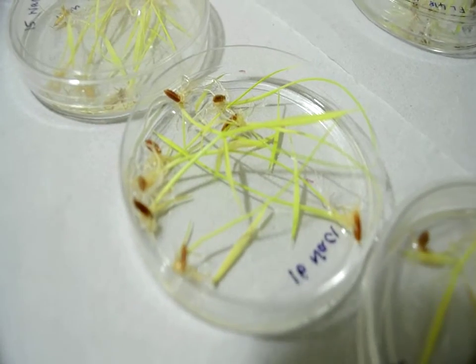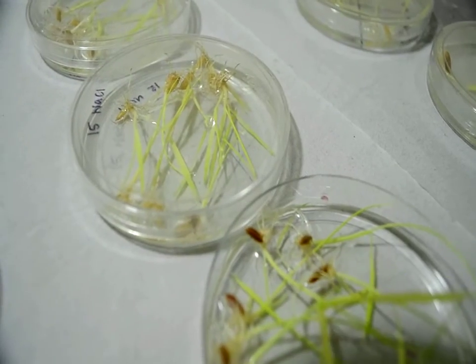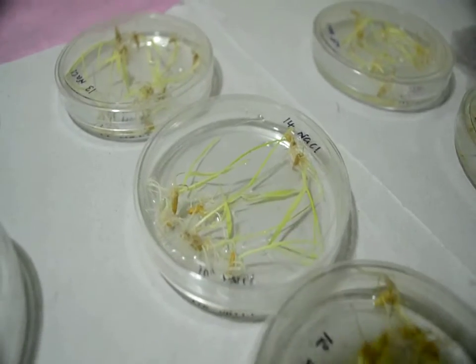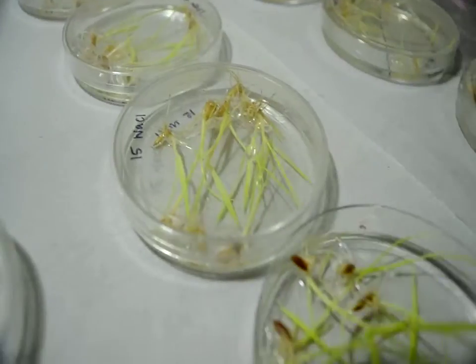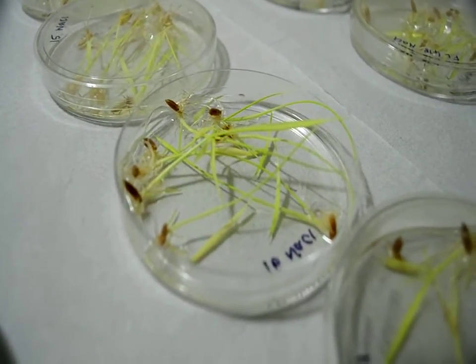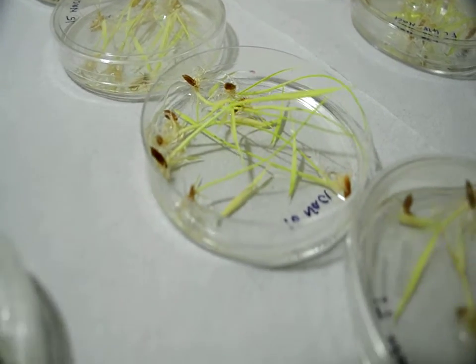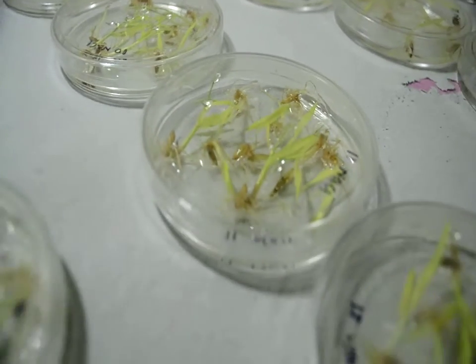This method is appropriate for rice because rice is a semi-aquatic crop that can grow in flooded conditions. The petri plate can simply be filled with water without any moist paper or wicking fabric, making it a peculiar method for rice compared to wheat or maize, which require regular aeration.